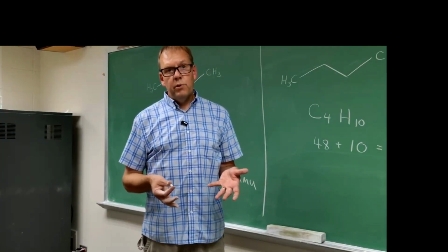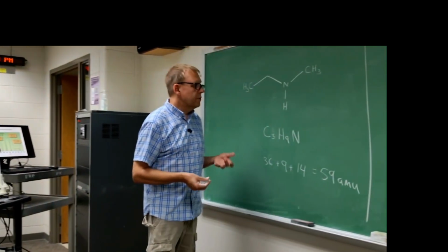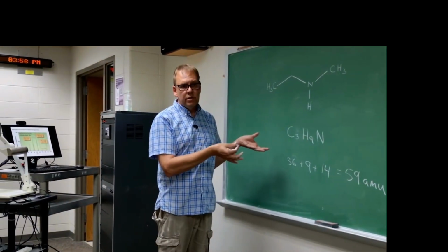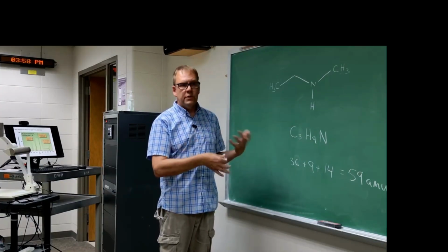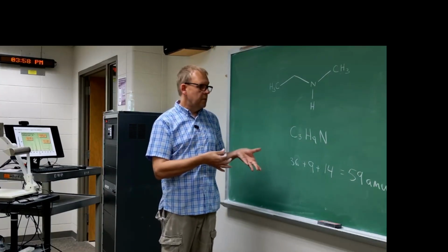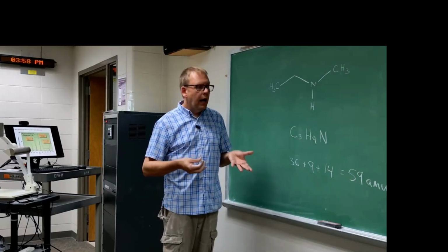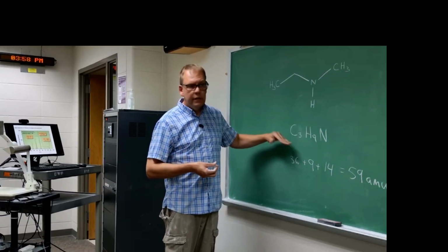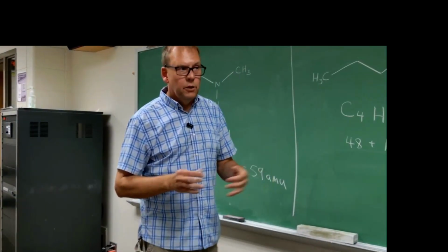And those are going to be pretty much most of the examples we're going to look at. We're not going to look at many examples where we've got 2 nitrogens or 3 nitrogens. They're certainly important and interesting, but it's just kind of beyond the scope of this class. So when you look at a molecular ion, just note, is it odd or even? If it's odd, think probably got a nitrogen in it. If it's even, probably no nitrogen. So that's a useful thing to know.